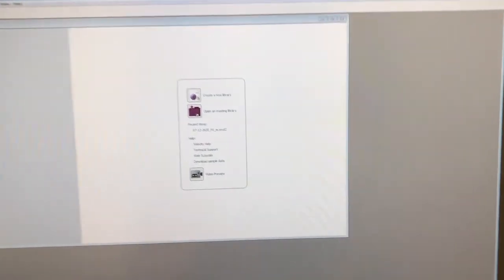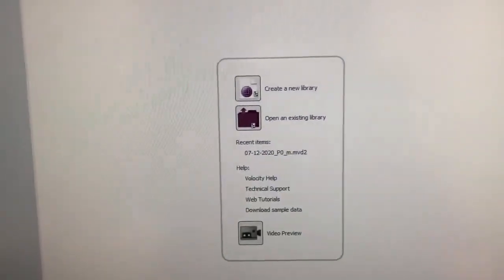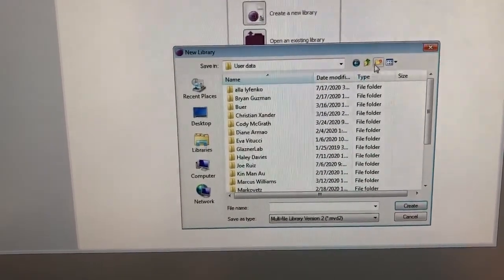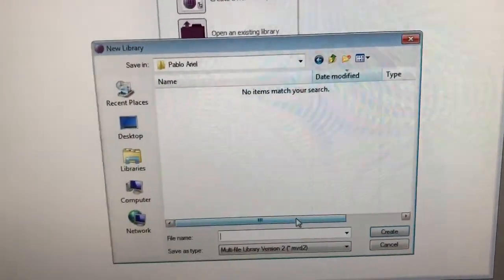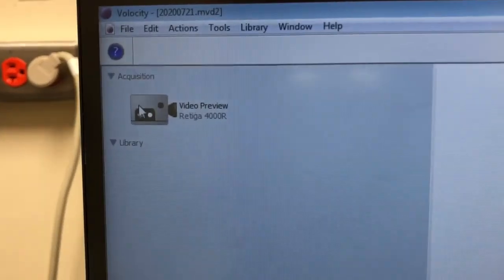Whenever Velocity starts, it asks whether you want to create a new library or open an existing one. The library is what Velocity calls the database where it puts your images. It's best to create a new one every day you come. I'll put it in Computer > Data > User Data, create a folder with my first and last name, and give the file a name based on today's date — in this case 2020-07-21. I'll maximize the Velocity window and click on 'Video Preview Ritiga' to get the controls in view.